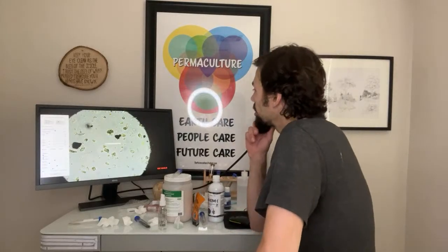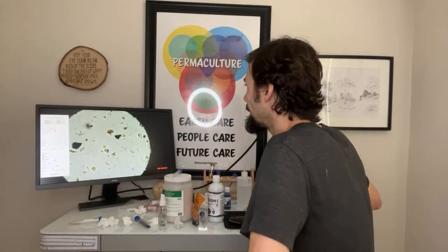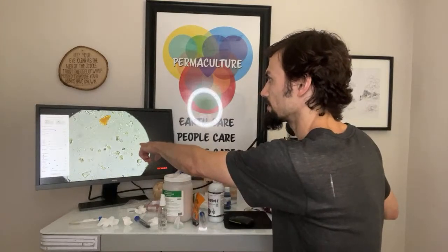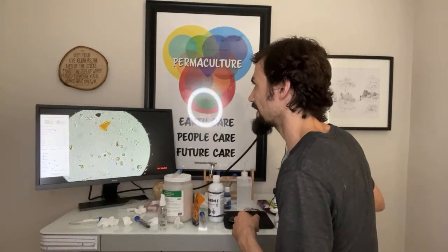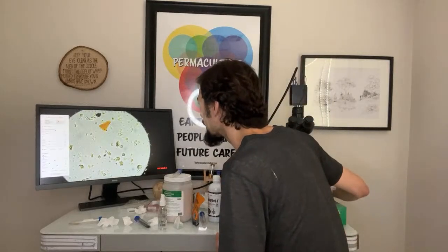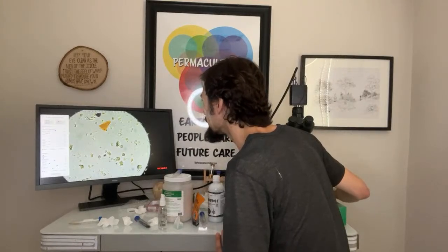Well, they don't have the spiky spores in this one. Well, they might. Let's keep looking. The shard, sand, it's silicate, right? Look at that. Or that could be something else. Let me look at that closer. It could be part of an insect.